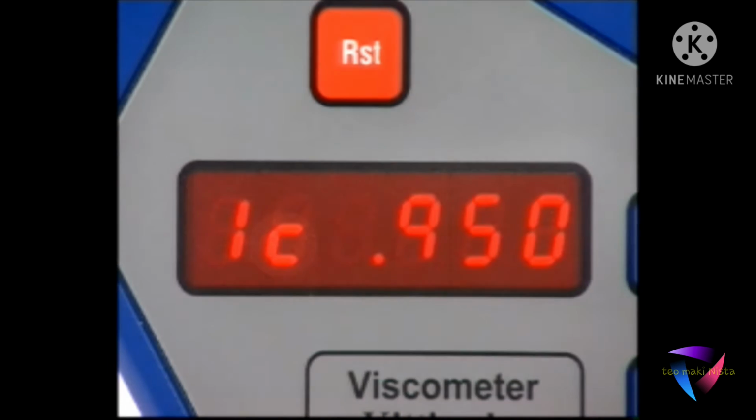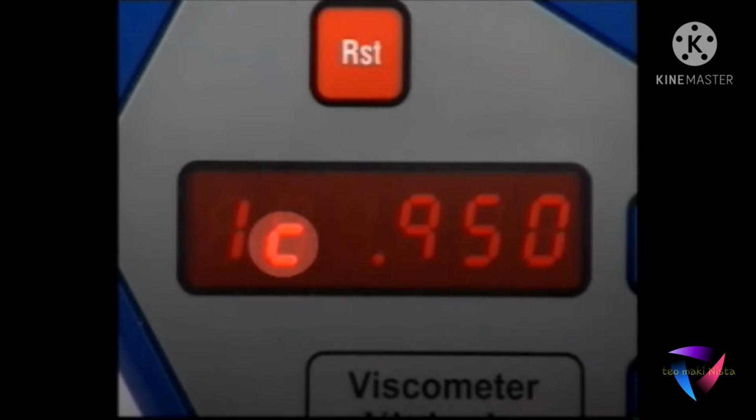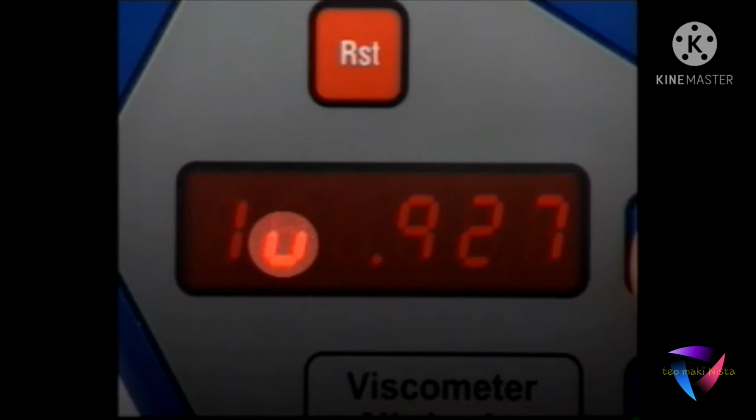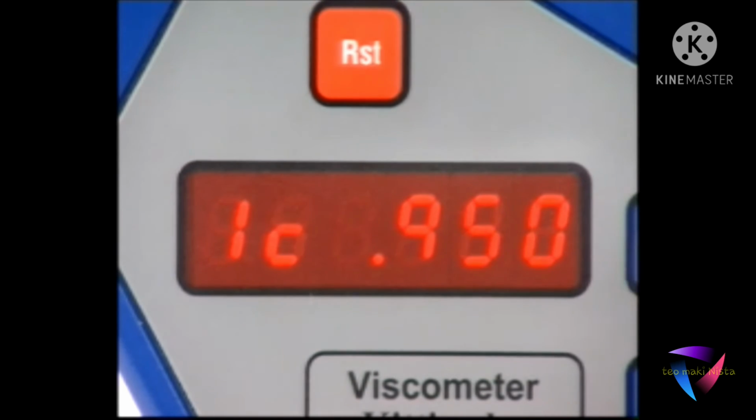In Mode 1, the small c indicates a corrected reading at 15 degrees Celsius in vacuo. If you were given a reading at 50 degrees Celsius in air, correct this by pressing Return and entering your uncorrected reading. Press Return again to obtain the corrected readout at 15 degrees in vacuo. This value will then be used by the viscometer for all the other calculations.